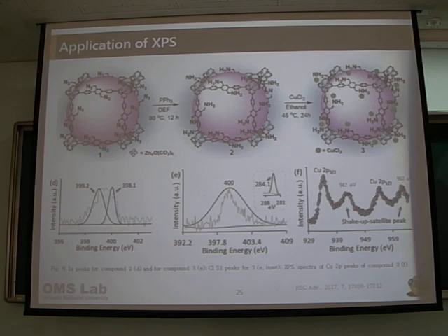After coordination, the primary amine, that means the left side figure, is primary amine. This is the nitrogen 1s. This one also nitrogen 1s, the middle one. The nitrogen 1s is fully different after inserting the copper chloride. But you have not shown the nitrogen peak. You just showed the copper first of all. First one, there is no copper.